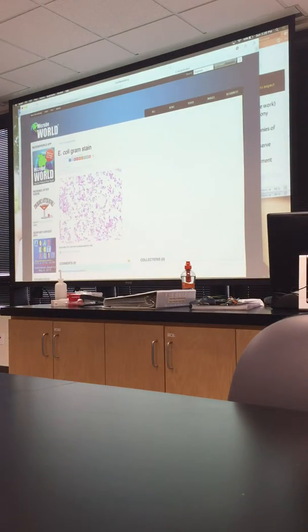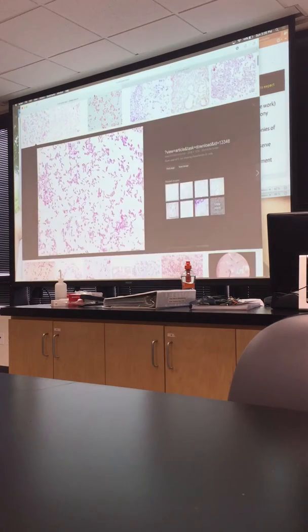That is a horrible example of E. coli. Okay. This is what E. coli looks like. The prepared slide that I have up here is a terrible example. This is what you should expect E. coli to look like. If you could recognize, look at that. It's gram-negative, so it's pink. It's obviously pink on my screen, but it's not quite so obviously pink on your screen.